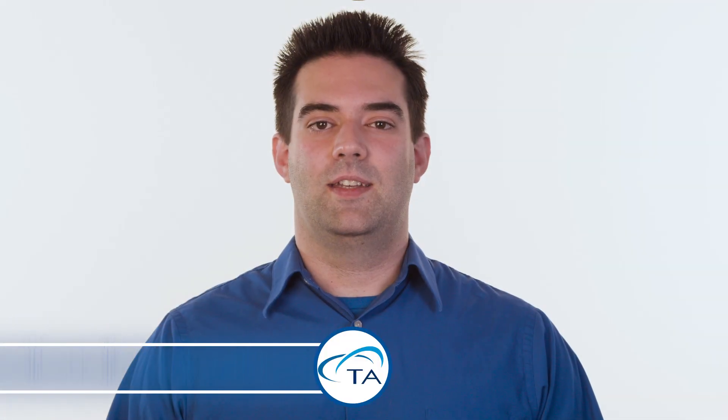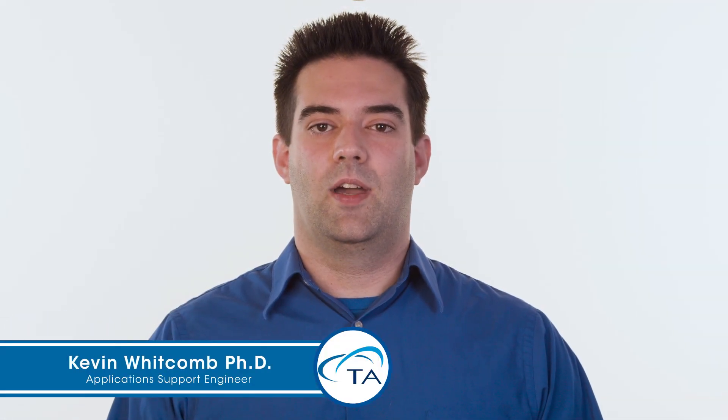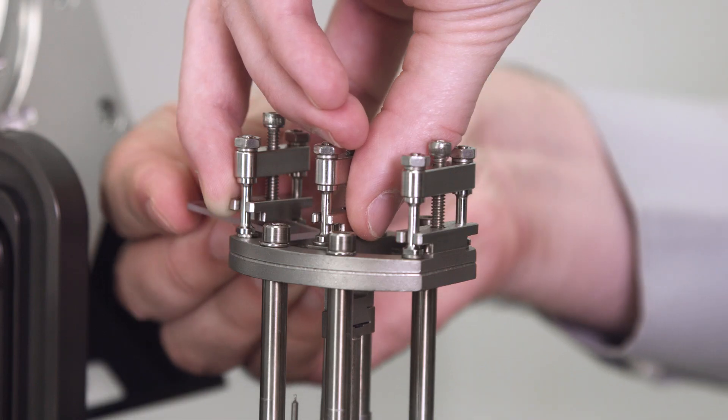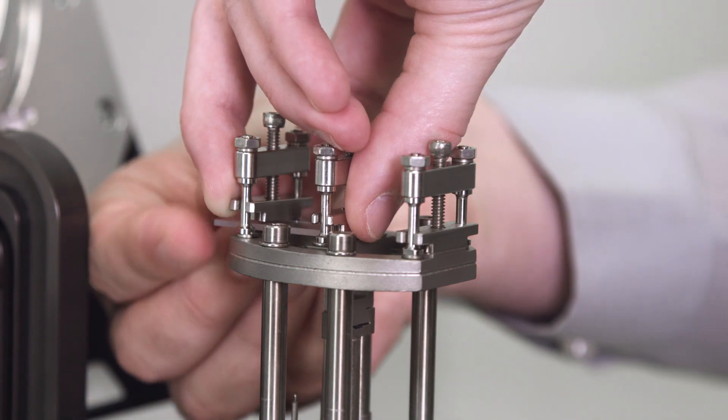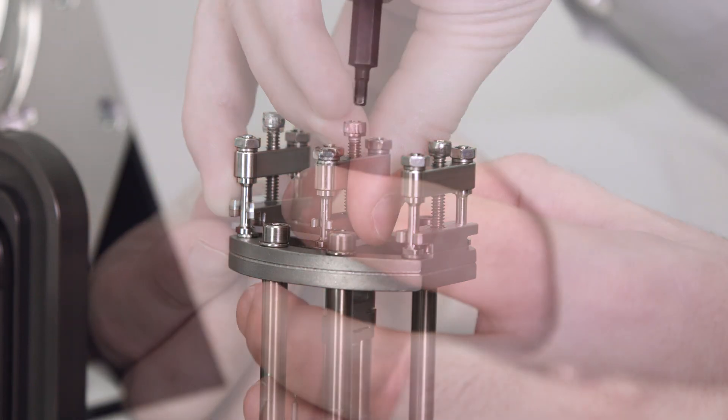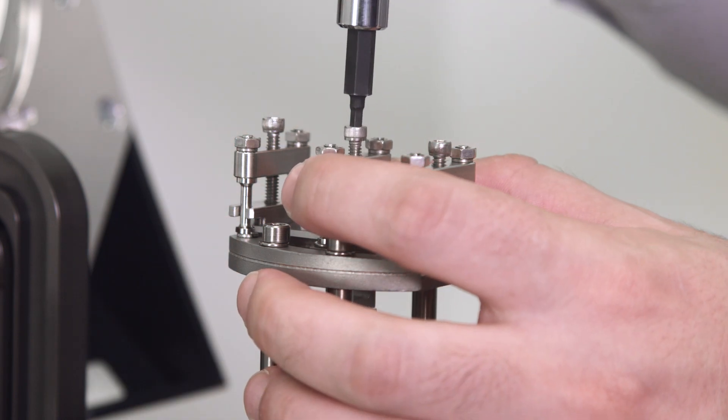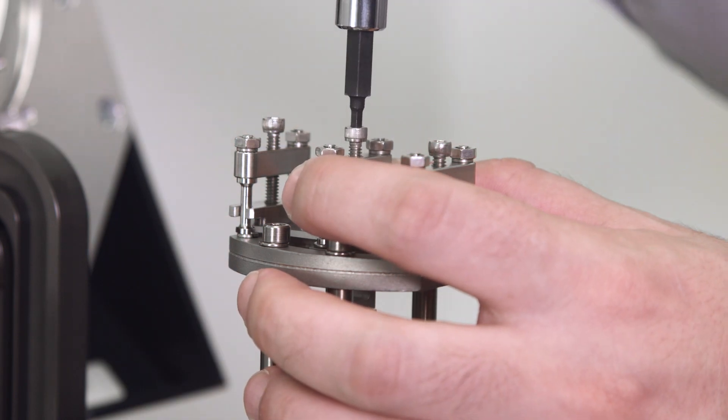Hello and welcome to another TA Tech Tip. This Tech Tip will show you how to set up a temperature ramp on the DMA850. The sample in this Tech Tip is a polycarbonate sample run on a single cantilever clamp and clamped with 8 to 10 inch pounds of torque.